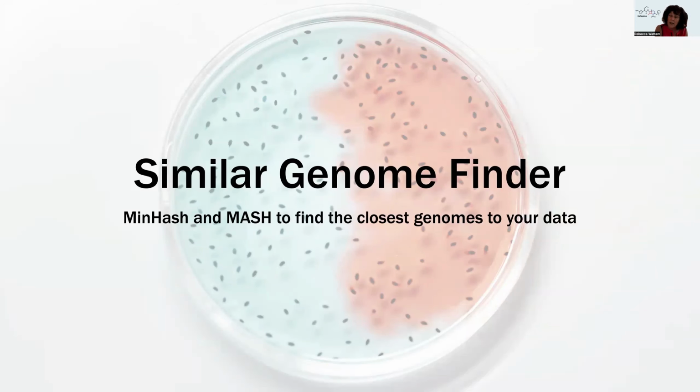And so you want to compare it and try to find what matches that phenotype you saw, what makes this genome interesting compared to other ones. Now, when you look at the BV-BRC resource, there are more than 1.1 million bacterial genomes. So how are you going to find who's close to your genome? Well, there's a special service for that called Similar Genome Finder, and it uses min-hash and mash to find that data.